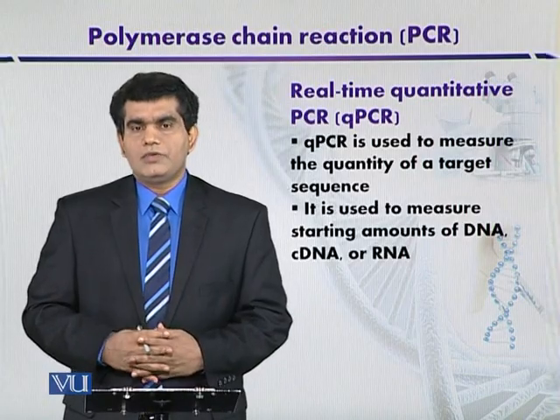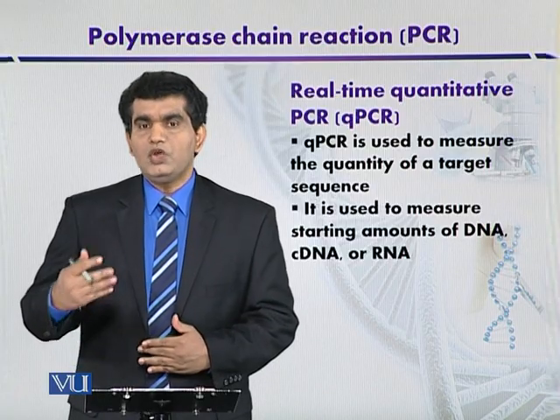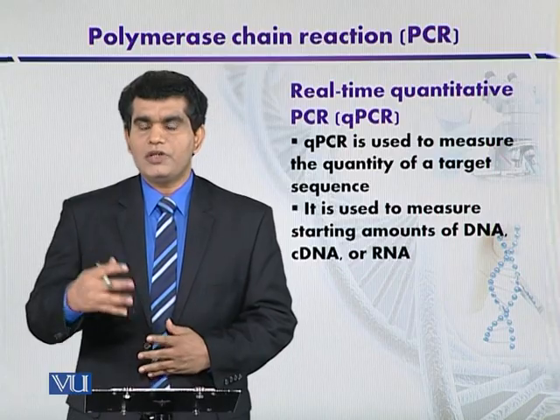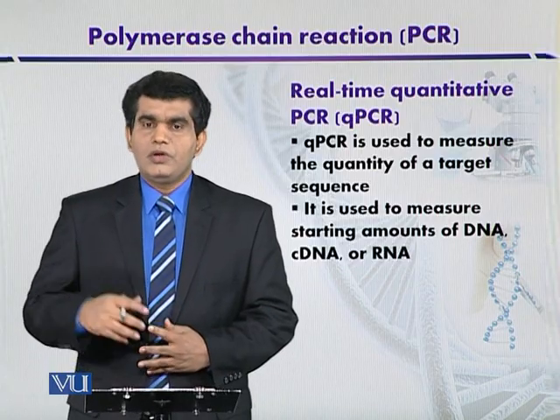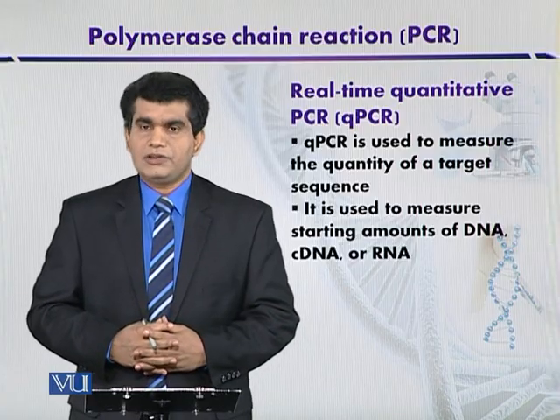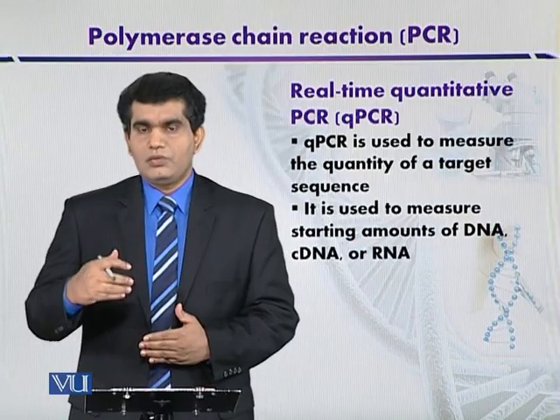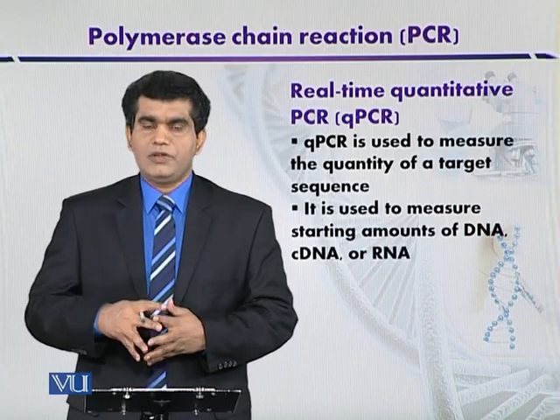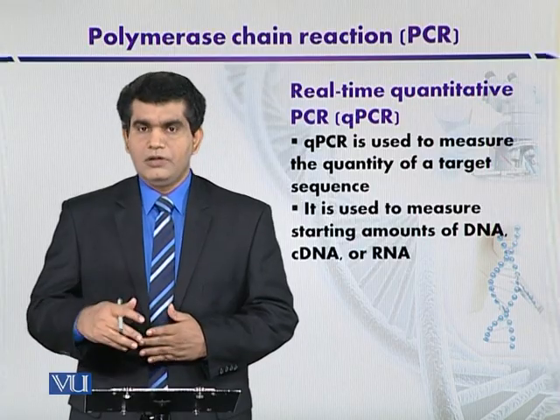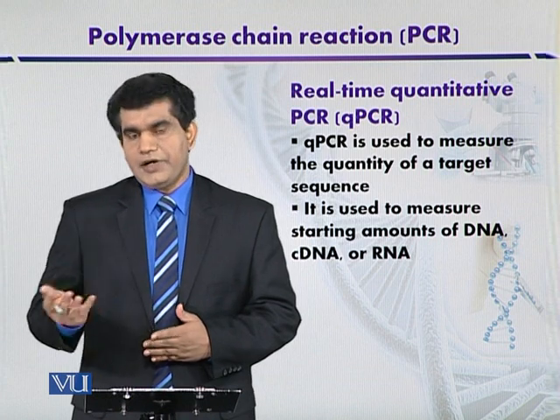रियल टाइम क्वांटिटेटिव पीसीआर, और इसको qPCR भी कहा जाता है, and it is commonly used to quantify the target sequence in the reaction mixture so that we can know the starting quantity of the biomolecules or nucleic acid like the DNA, cDNA or RNA molecules.